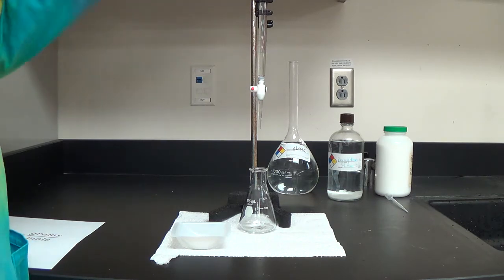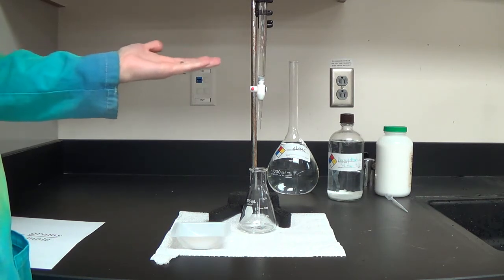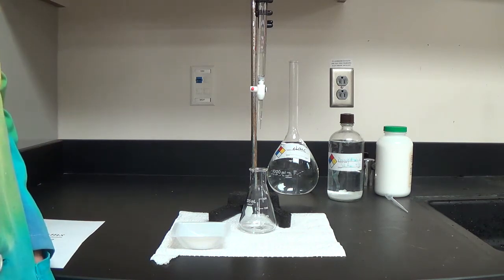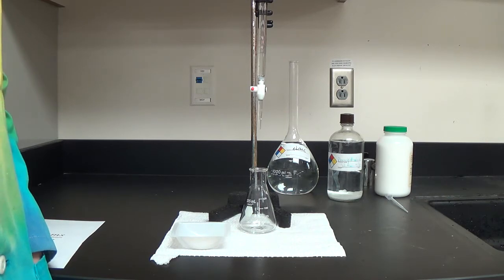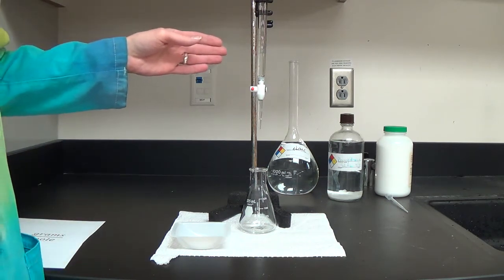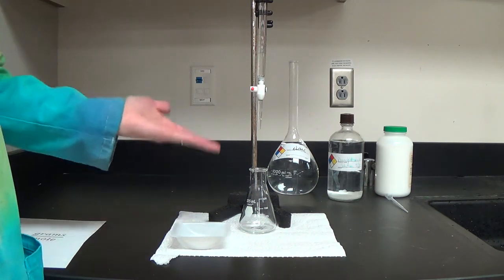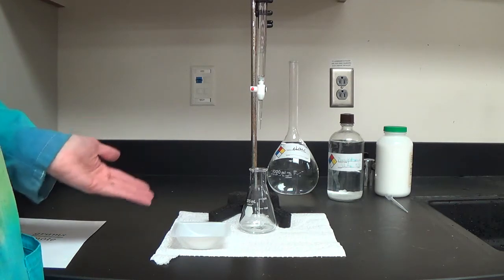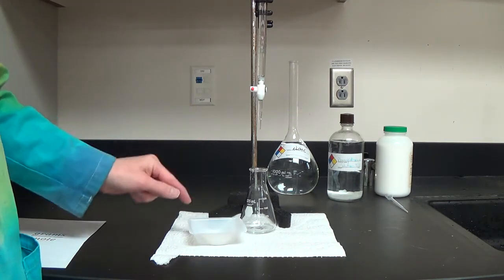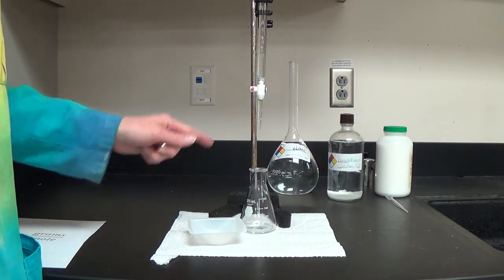If you are nervous about pouring from a little beaker into the burette, use a funnel. You do not necessarily need to start at the very top — it's probably a waste of time trying to get it exactly at the top. So I have my double rinsed burette, and I have a flask which I made sure was clean. I don't need to double rinse it because I'm not putting anything precise into it — it just needs to be rinsed. I have measured out my unknown acid, recorded the grams, and I'm going to put it in the flask.